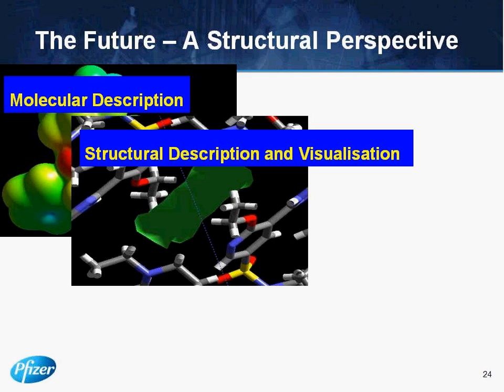And whilst I've given you a view of some emerging tools, I would like you to think of them from a very practical perspective. If I'm a development scientist, the sort of questions I'm interested in understanding is, how often do these new forms, these new polymorphs appear? Will they appear for my candidate? How many experiments do I need to do to ensure robustness? How complicated is my solid form state? How much do I need to explore? And what will be the impact of any changes on my solid state structure from the biopharmaceutics and my stability? So can I describe that in a more holistic way?